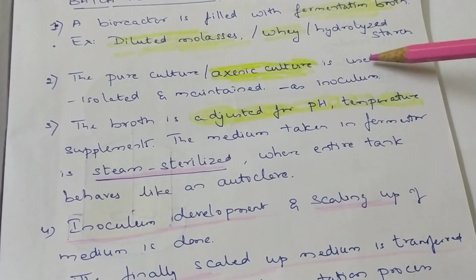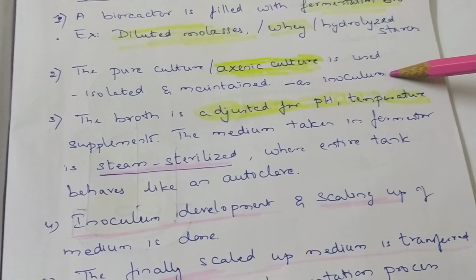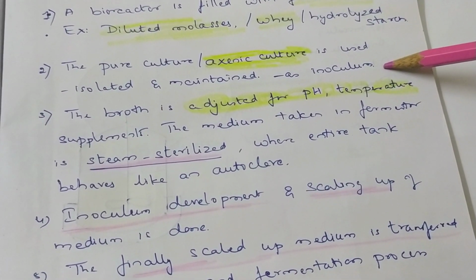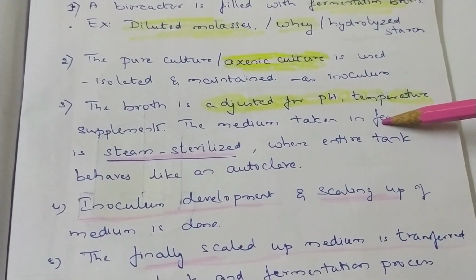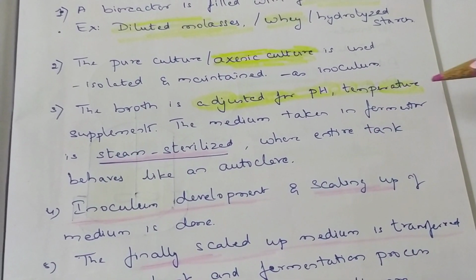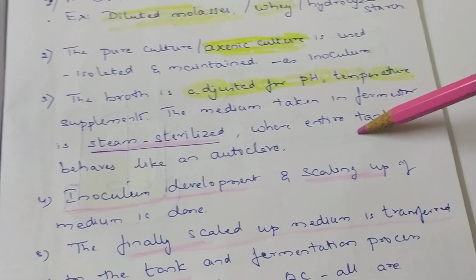There can be a class on inoculum development. That is called the upstream process. Inoculum development is an important part of the industry. Please keep this in mind, there can be a question over that also. The broth is adjusted with a specific pH and temperature with supplements, and the medium is taken in the bioreactor and it is steam sterilized.